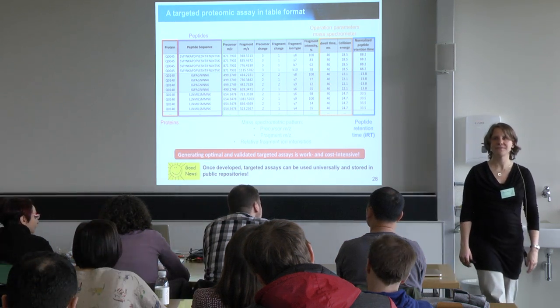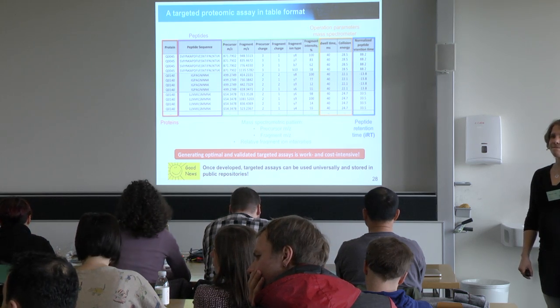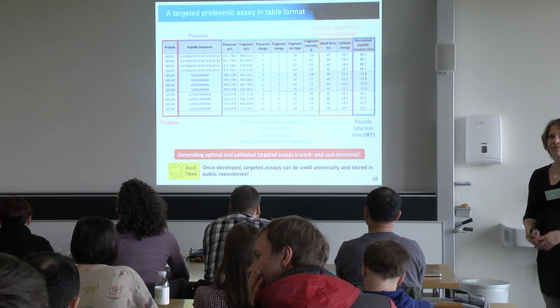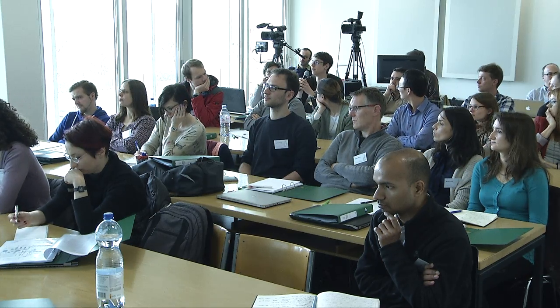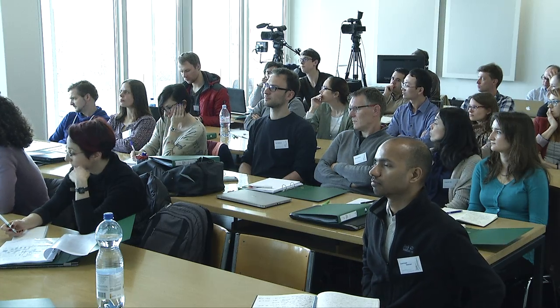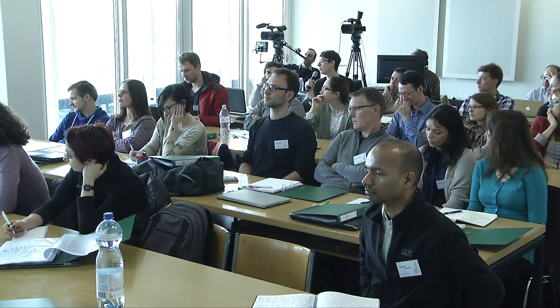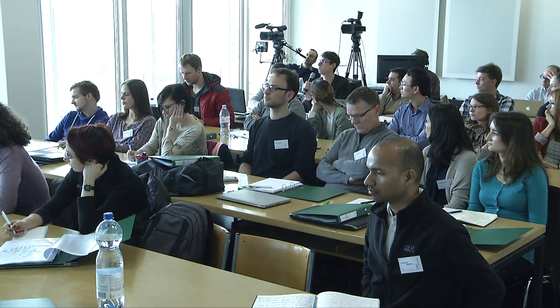Yeah. Sorry. So you mentioned several times it's really important to start from empirical data, but in our hands it's often very much dependent on the background of the sample, whether you will measure it or not.